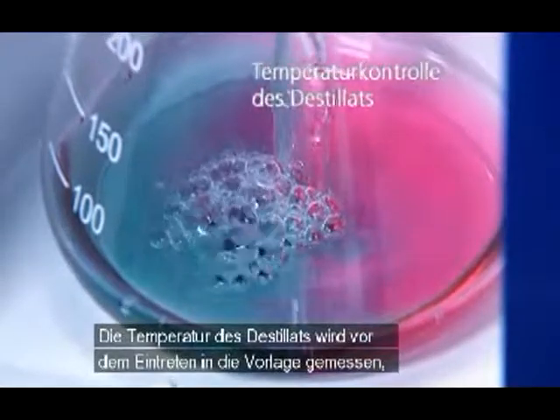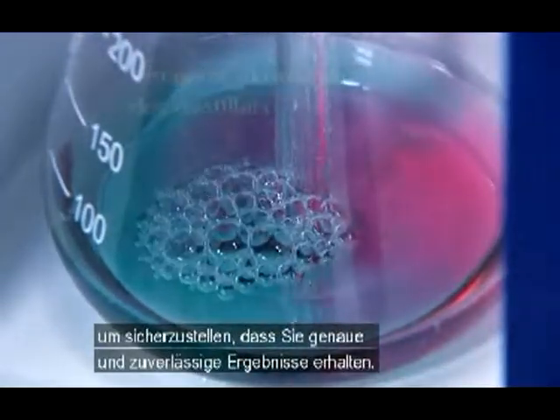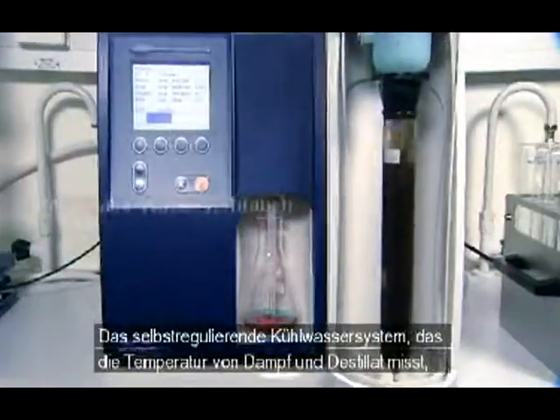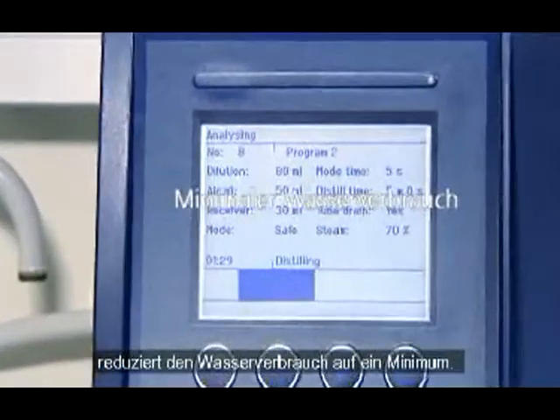The distillate temperature is measured before entering the receiver to make sure you get correct and reliable results. The self-adjusting cooling water system, measuring the steam and distillate temperature, minimizes water consumption.